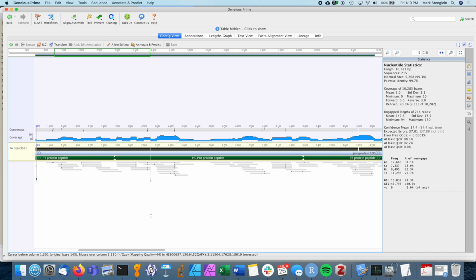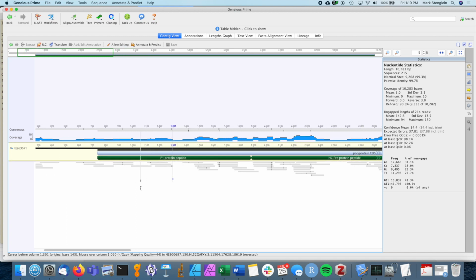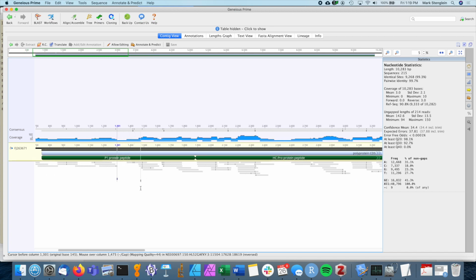The other thing you can notice is that there's variance in this sequence relative to this reference genome that we used. Because the reference sequence from GenBank that we used to make the bowtie index is not exactly the same virus as what we're sequencing, there are variants, there are SNPs in the virus from sample FW19 relative to this genome.